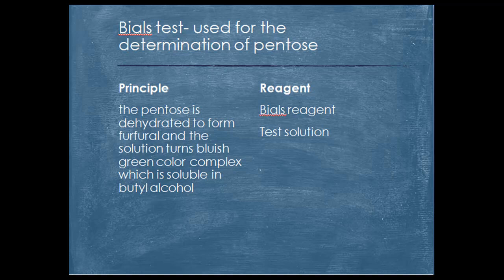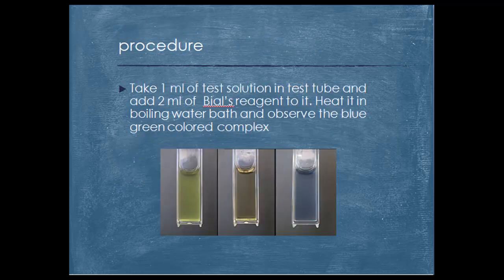Pentose is dehydrated to form furfural and the solution turns a bluish-green color complex, which is soluble in butyl alcohol. These are the reagents used. You can see the presence of the blue-green colored complex, which confirms the test.